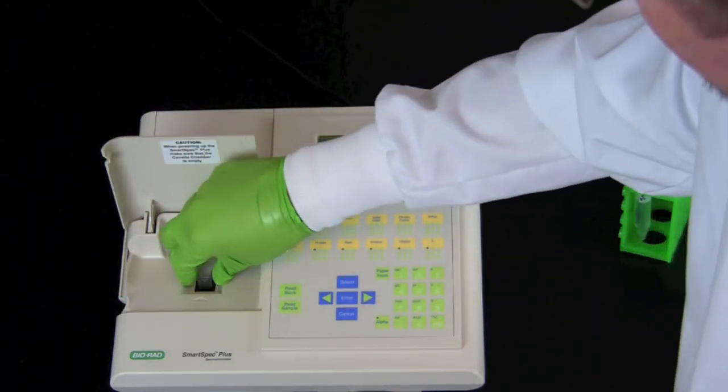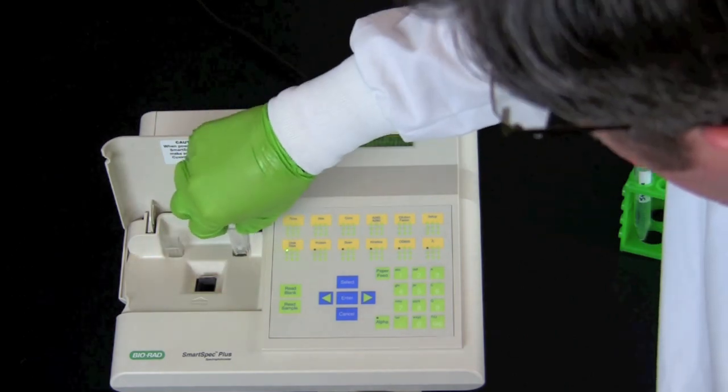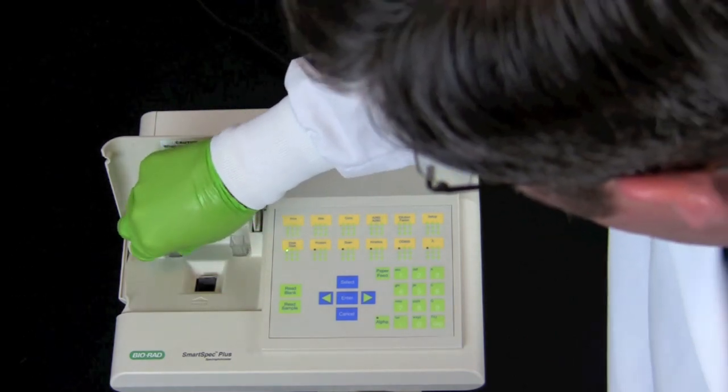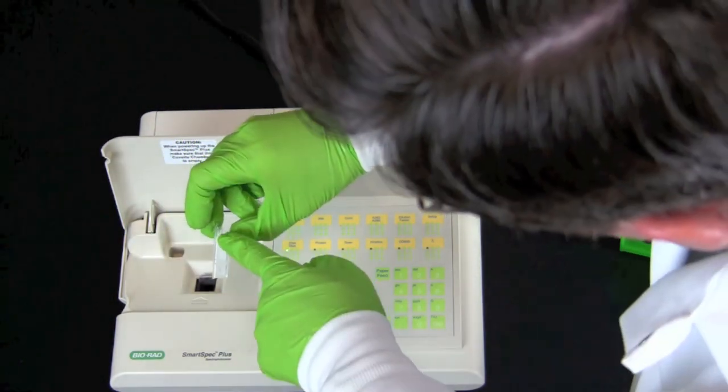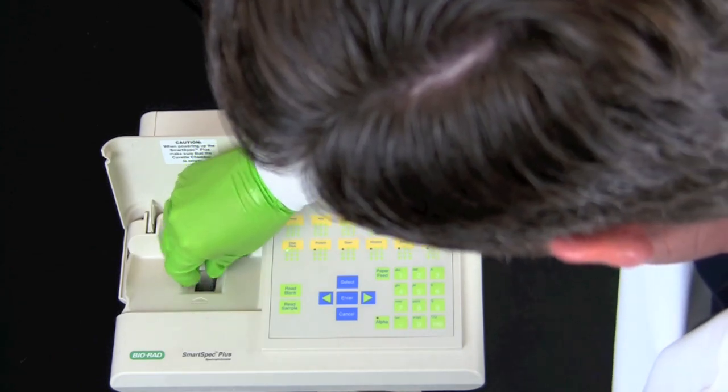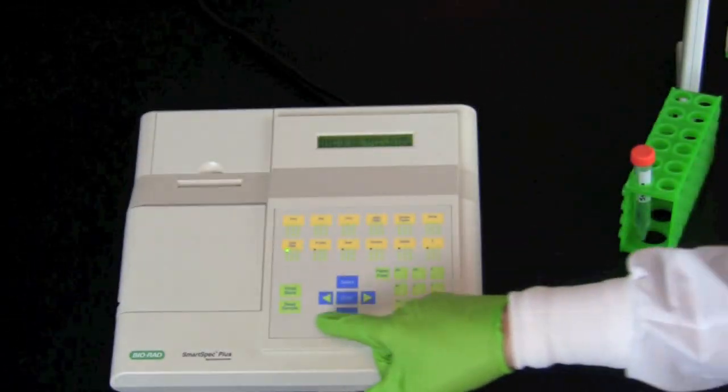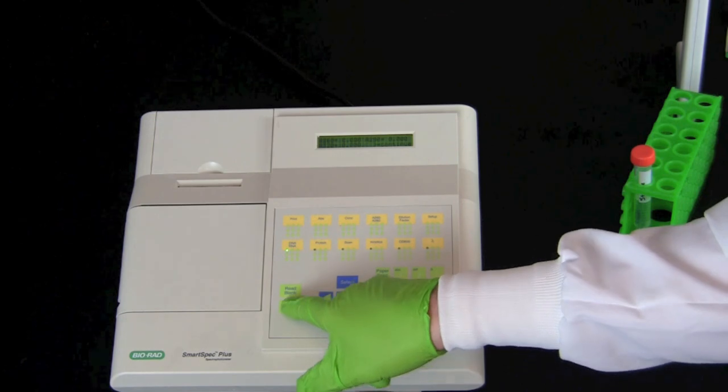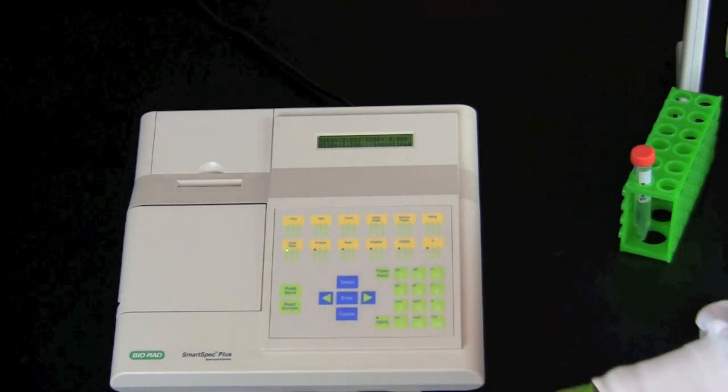Remove the control cuvette and insert the test cuvette with the DNA sample. Press the read sample button and then hit the right arrow.